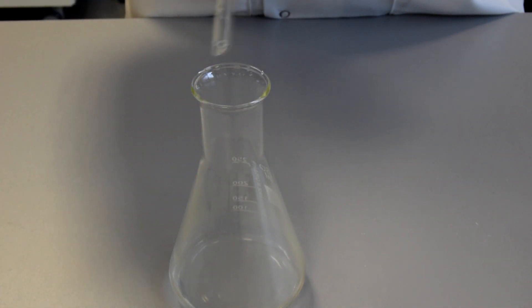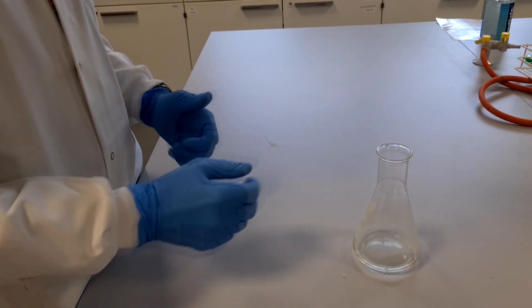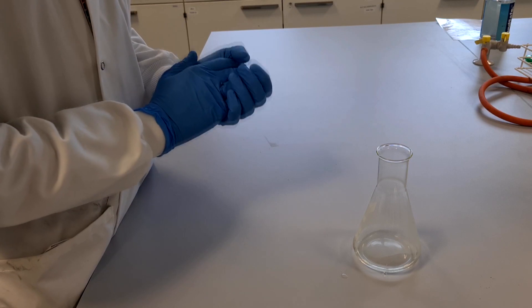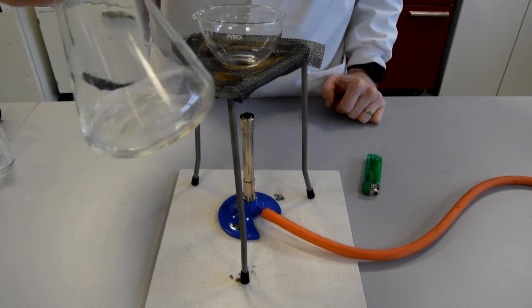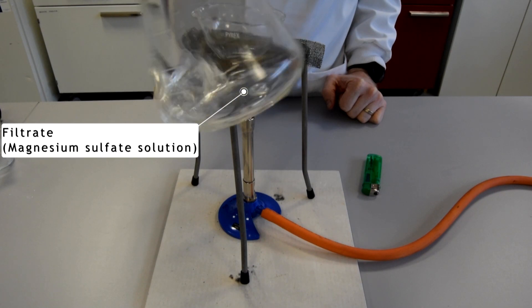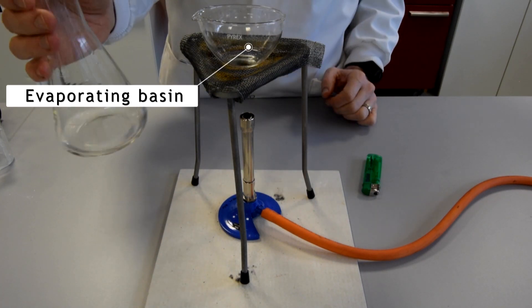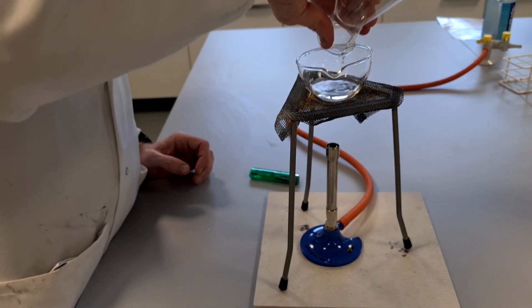The next stage of obtaining the magnesium sulfate salt is to evaporate off the water. I have my filtrate, which is my magnesium sulfate solution - a solution of magnesium sulfate in water. I want to separate the magnesium sulfate from the water to leave me with the magnesium sulfate salt, and I'm going to do that by evaporating off the water. So I pour my magnesium sulfate solution into an evaporating basin.